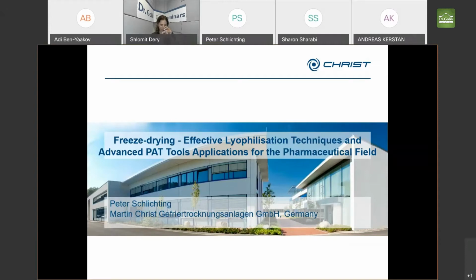My main business is the pilot and production freeze dryers, and of course I also have experience with the lab scale freeze dryers. So in my presentation I will go over all freeze dryers that are on the market, that means all sizes. And now I will start.